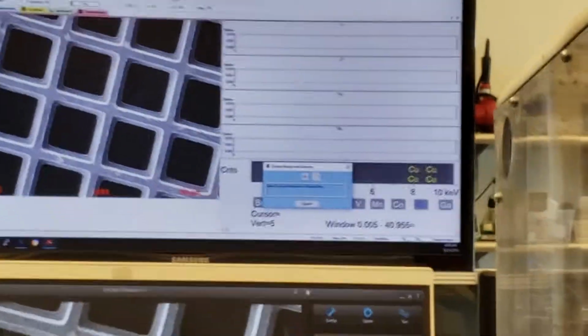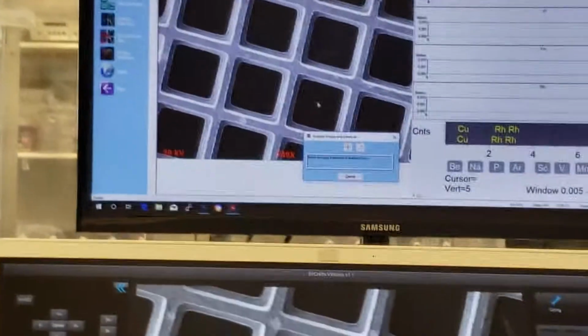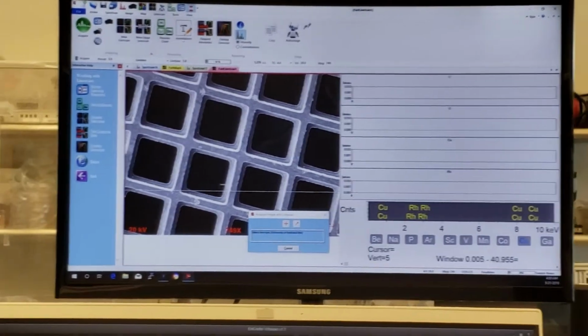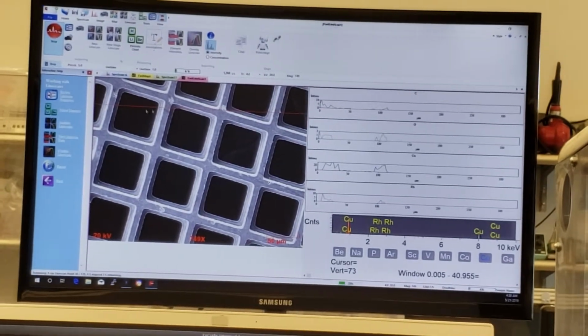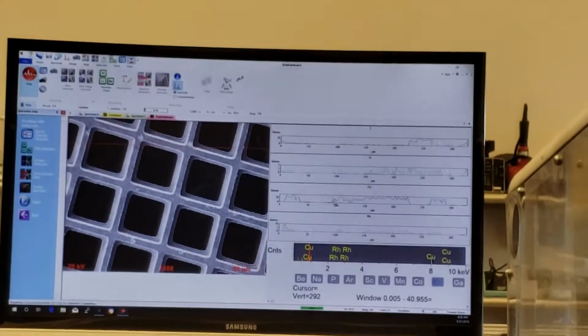So that's finished. Okay, so now it gives me this window up here, Alex. See this little guy right here? So I could grab this guy, and if I bring it up here, see it gives me a dash. If I left click my mouse and drag this anywhere and let it go, let's say if I let it go there, it'll automatically go in and take a line scan right across that area. So right now, it finished.